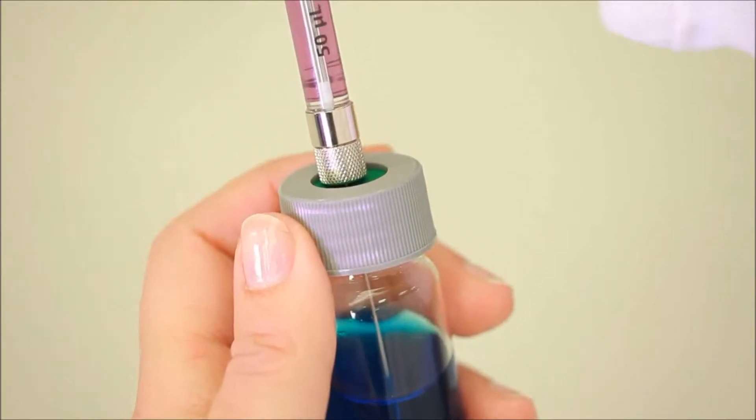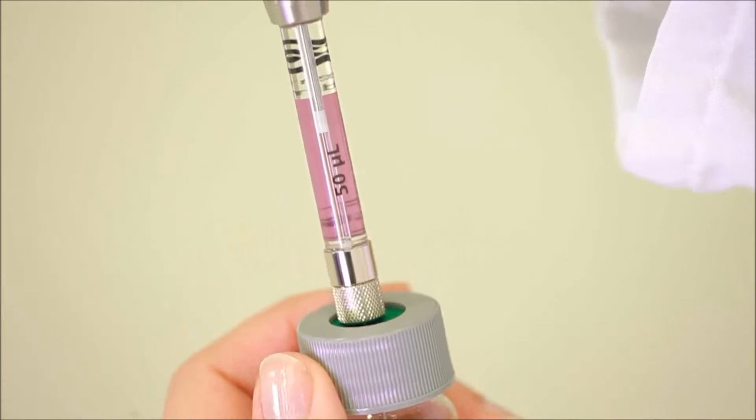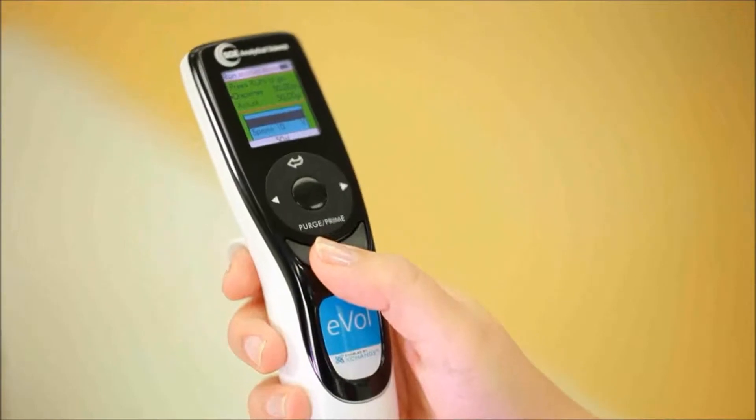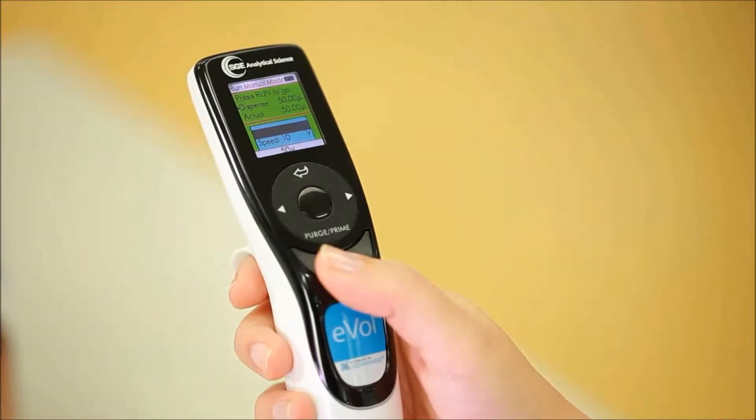EVOL allows you to aspirate and dispense liquids quickly and accurately, even in and out of sealed vials, providing more flexibility than ever before to simplify workflow.